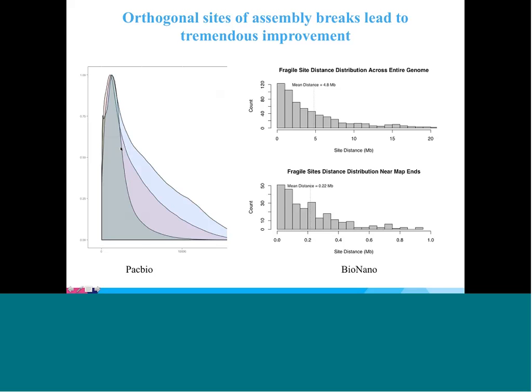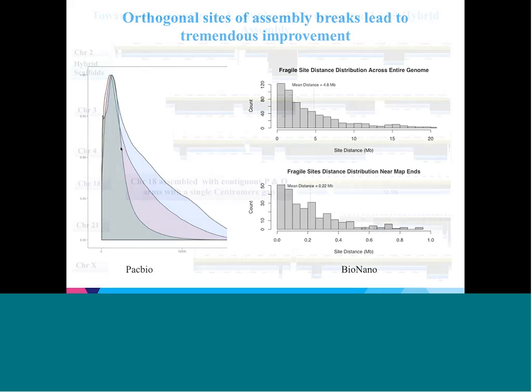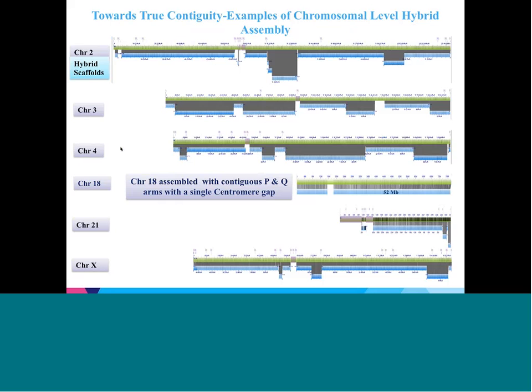All right, so we did that very high-level overview of some of these assemblies. If we zoom in, how do they actually look when you align them genome nick site to nick site? What you can see is that these are extremely highly conserved. It's hard to see on this particular image, I realize, but the fact that it's all gray means that basically every single one of those nick sites is aligned to each other. So it's a very high quality alignment of these regions. In some cases, you'll notice in this first one, you have a little bit of an expansion. That suggests there's probably some structural variations in there. But in general, you see very high quality alignment of our contigs to the genome, even though occasionally, as you can see by the area I'm marking with my arrow, you do have regions which we did not cover.